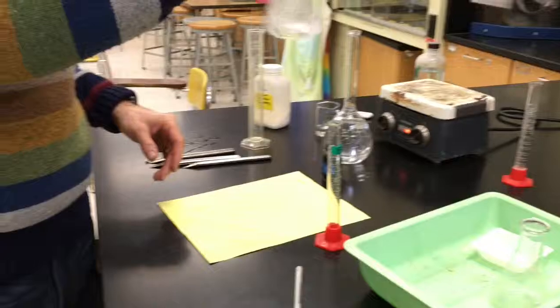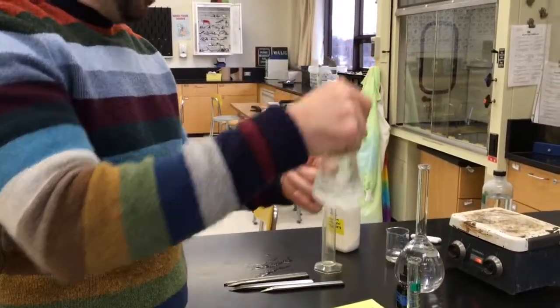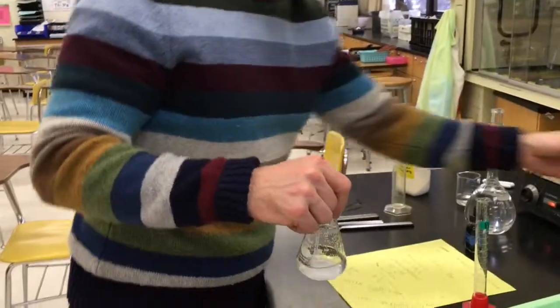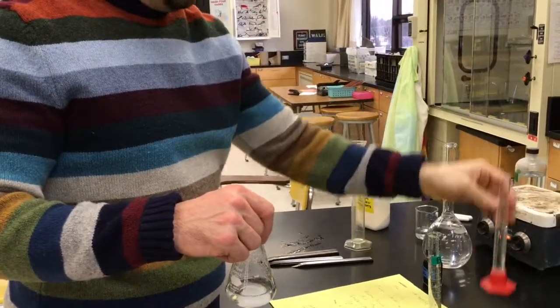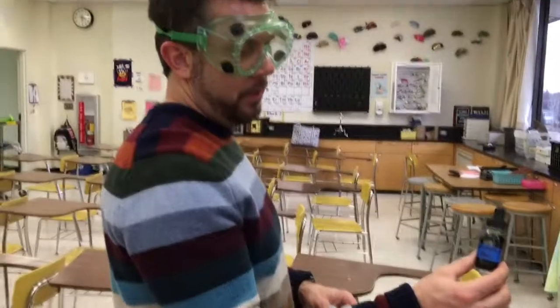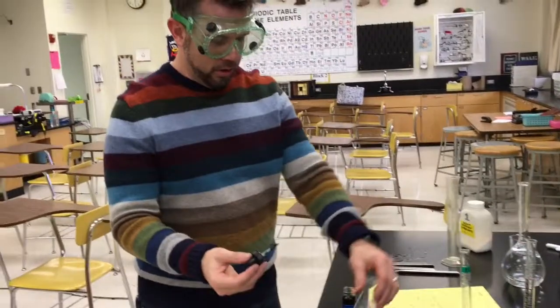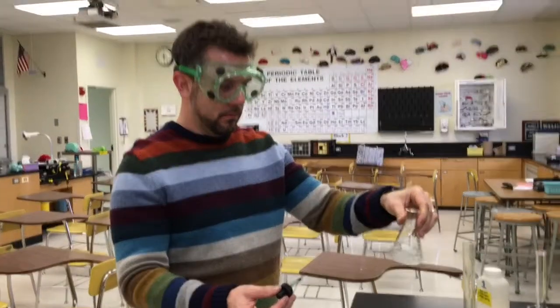So now roughly a 1 molar solution here of sodium bicarbonate. And in your graduated cylinder here is 1 molar hydrochloric acid. So this is new to us. We're going to be studying pH, but this is called an indicator. This is bromothymol blue, and in the presence of base, it should be blue in color. So I didn't swirl it very well. While you're swirling, I'm going to go grab the lab, so we'll pause.